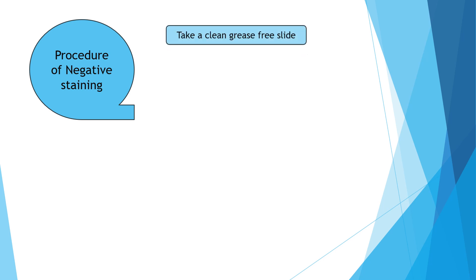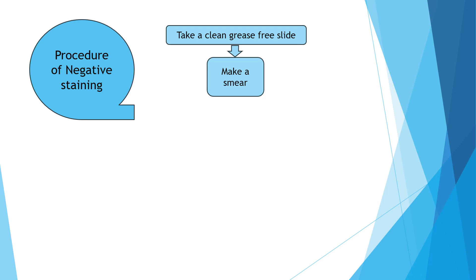First, take a clean grease-free slide. To make a clean grease-free slide, take a glass slide, wash it with detergent, air dry the slide, then pass the slide through a Bunsen burner flame two to three times. Then you will get a clean grease-free slide. Further, make a smear.